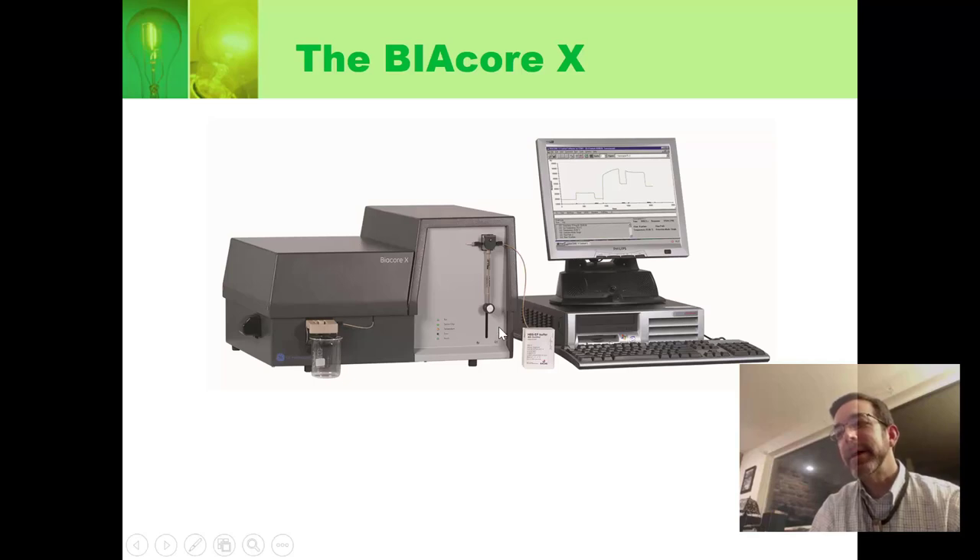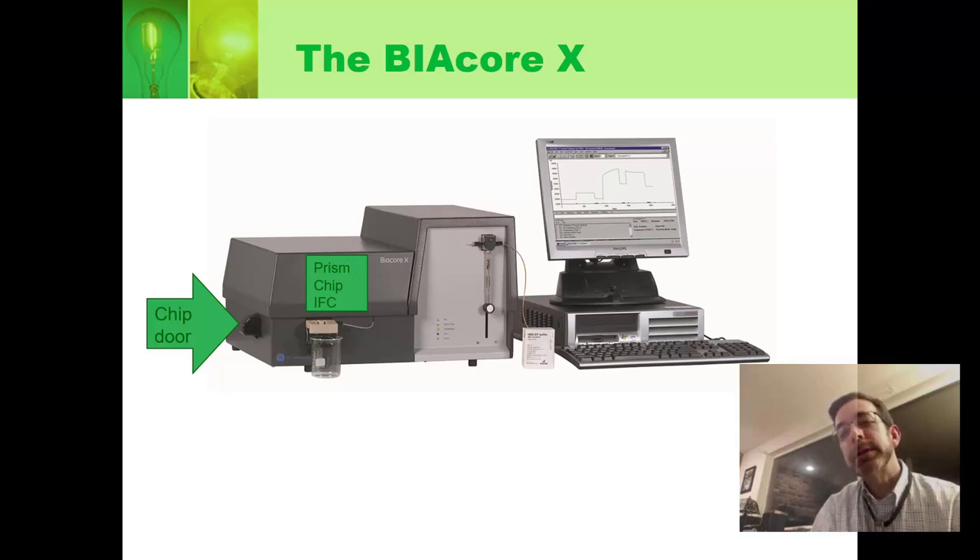That's the Biacore X right here. It's much smaller than the other ones, but has the same basic components. There's a door where you put your chip in, and in the body you have your prism — the chip sits in there, and the IFC sits below it. The IFC rubber is orange. You have the inlet for the buffer — it's actually just a syringe as the pump. The syringe pulls stuff up and pumps it through, it does all its valve opening and closing, passes it over the chip, and it goes out into the waste.